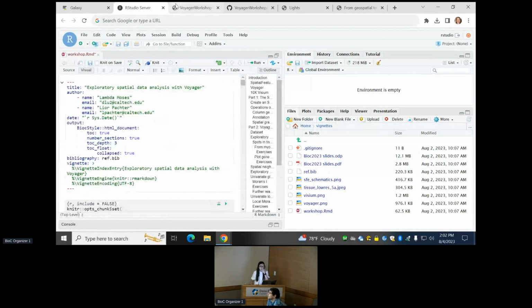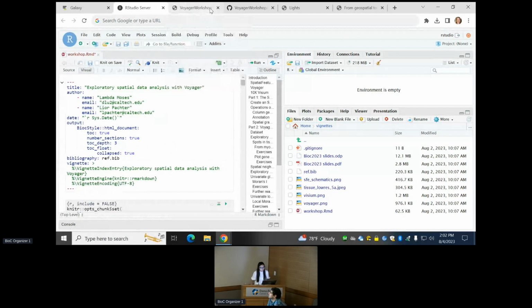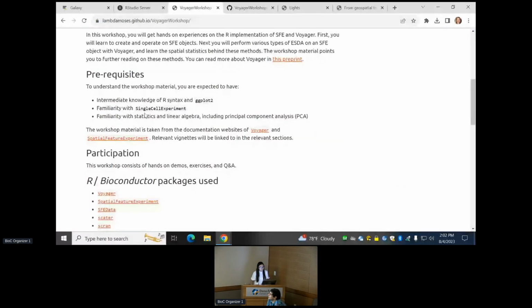All right, so while you're setting up, I'll do the intro. This website has the rendered version of this workshop. Here I expect you to be already familiar with SingleCellExperiment.